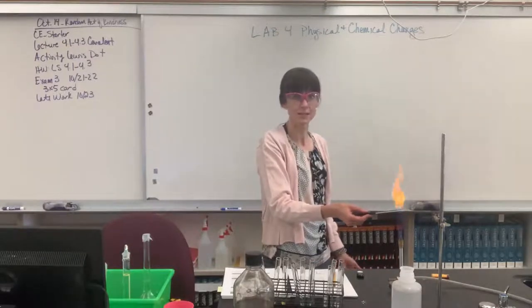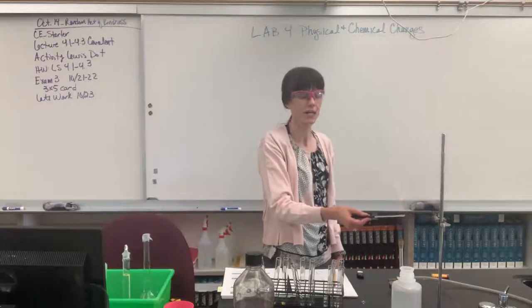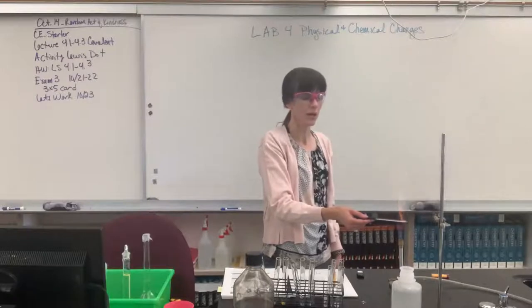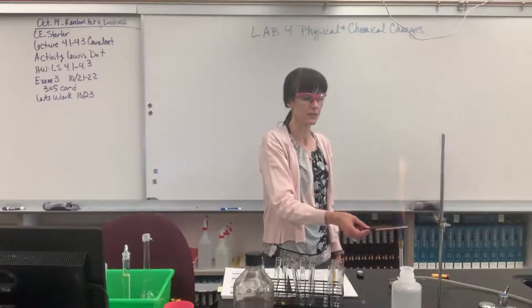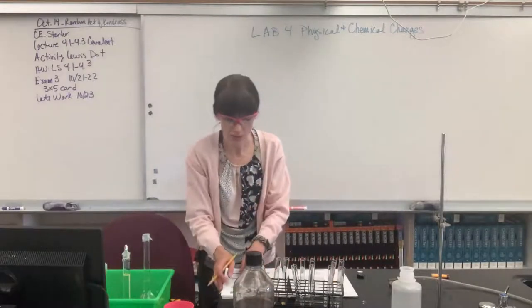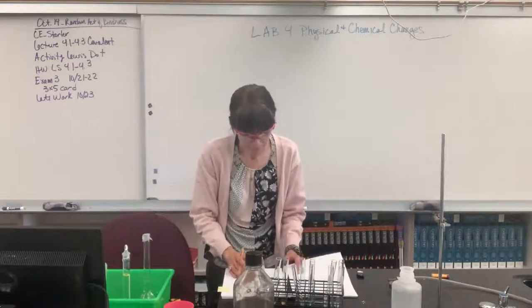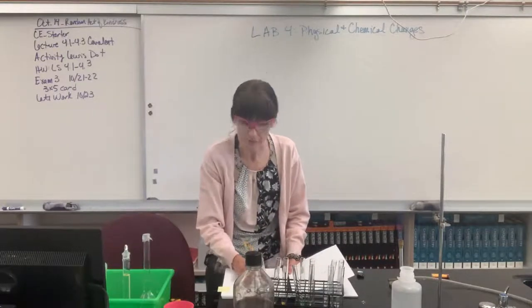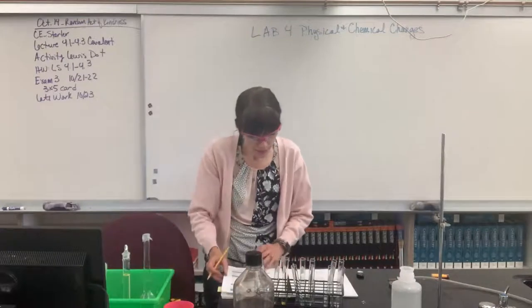So what does that tell us? It tells us it's sodium chloride. Even though I dissolved it in water, when I removed the water, it didn't change. And so it would be considered a physical change. I was able to reverse it. I have the sodium chloride back. Nice, so let's go back to our data table. The recovered solid is indeed yellow, still yellow. Let's see what our next part says.